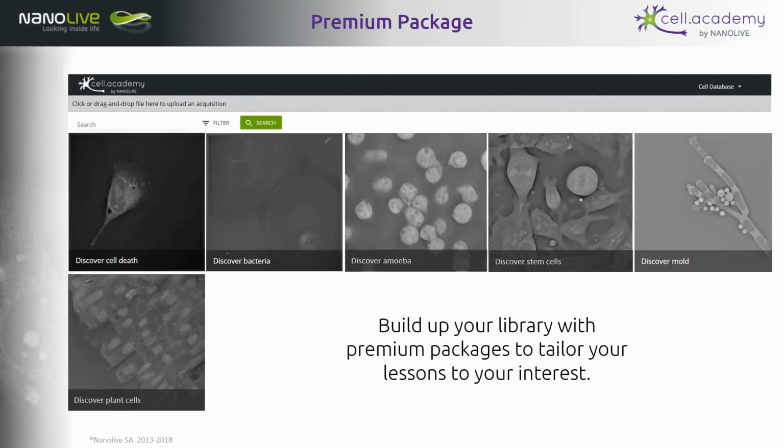So as you can see, there are endless possibilities of processes and cell types that you can observe with these different lesson packages. At Nanolive, there are scientists working on new applications which we constantly add to the library. So this data is all unique and it provides information that was previously inaccessible.